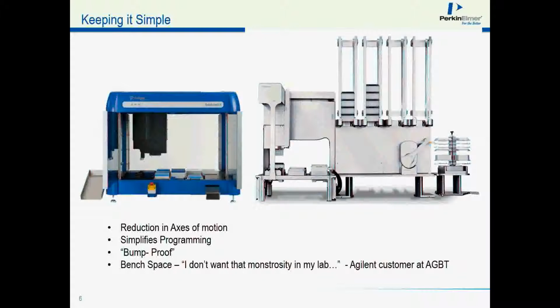So looking at the platform, here we have just 2 instruments, but the left one, which is a Sciclone, is contained basically within an environment. There are doors that can open and close, and on the back side and on the left and right side there is plexiglass, so that once you close the doors, all your samples are contained within that environment. It's not open to the open air and so forth.